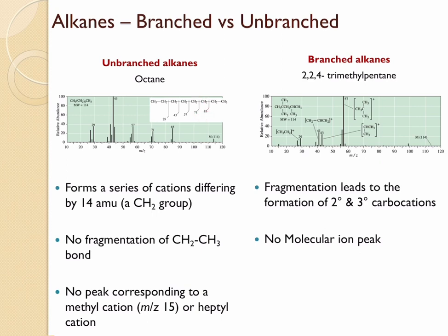And also, you do not see any fragmentation of the CH2-CH3 bond. Say, for example, this bond doesn't break at all. If it were going to break, then you would see a peak that corresponds to the methyl cation and another one for the heptyl cation, right? But you do not see any peak that corresponds to this C1-C2 bond breakage.